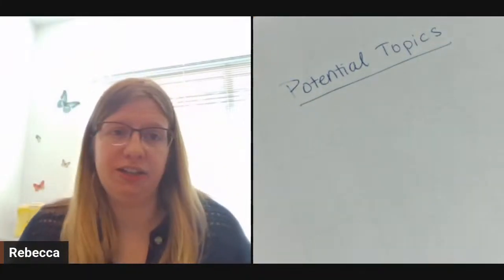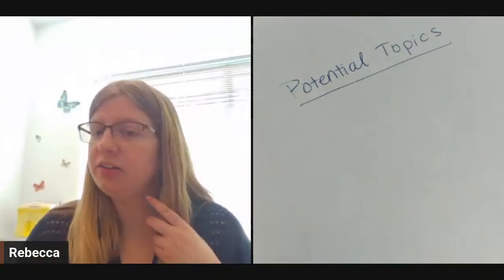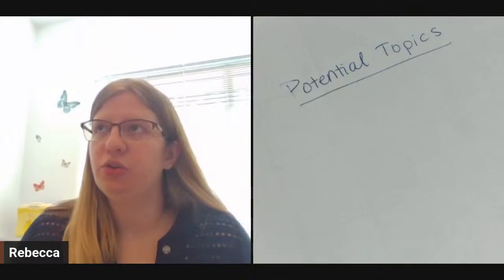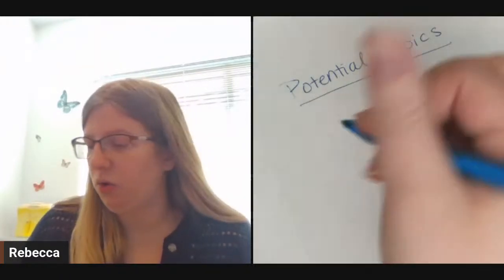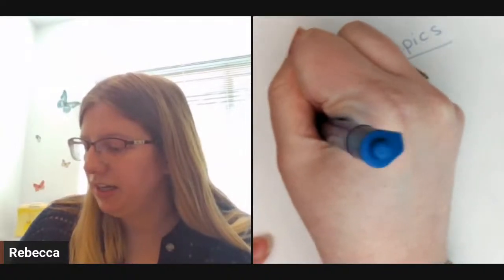Some of the things are going to be pretty similar to what you did see on your mini practical. Let's see, that first question on the mini practical that we just had a few weeks ago was about gram staining.